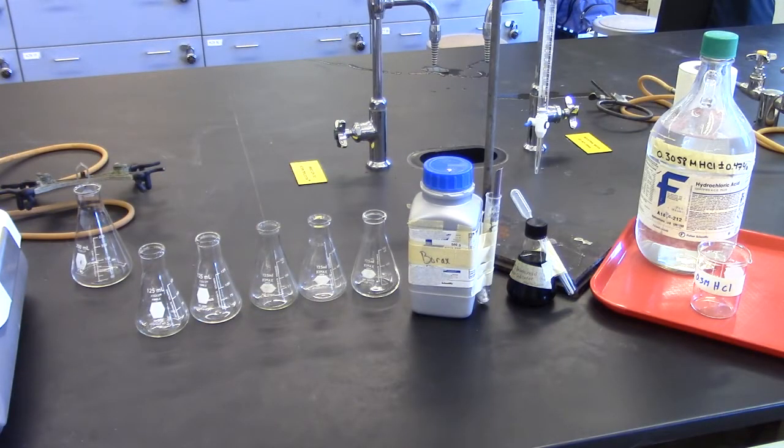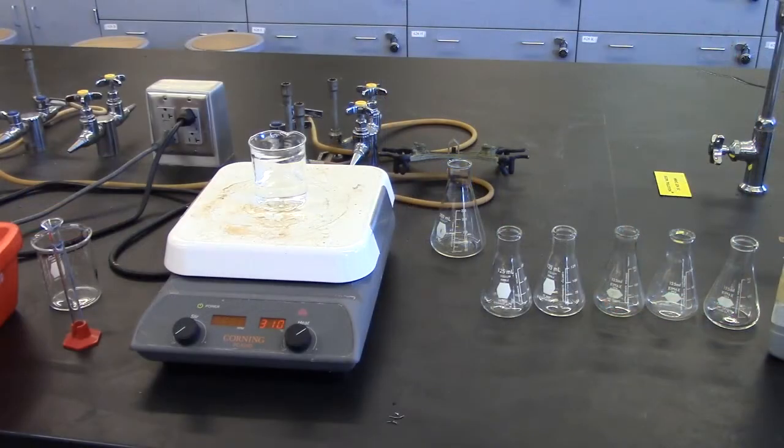This lab requires five 125 milliliter Erlenmeyer flasks, a bottle of borax, indicator solution, a burette, and 0.3 molar HCl. You will also need a hot plate.